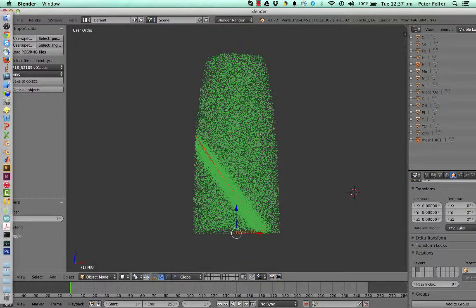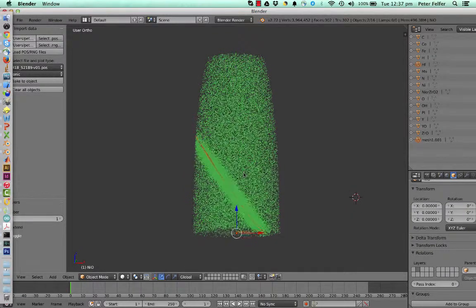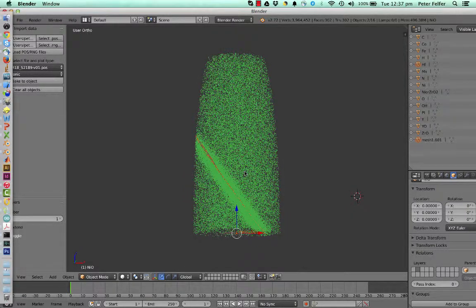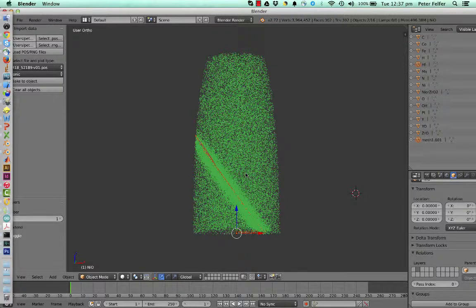So for this tutorial, we'll start out with a grain boundary here. It's actually fairly trivial. I've created it so that it's once again a reference data set. If you want to have it, just shoot me an email. It's unfortunately a bit too large to put on my web page. And if you go through it, you have exactly 10 atoms per square nanometer. I know that because I've created it that way. And you would get pretty much exactly a curve like the one that you saw before.